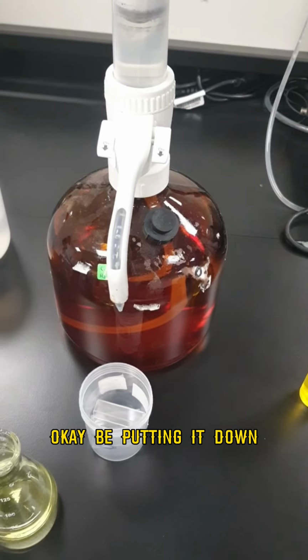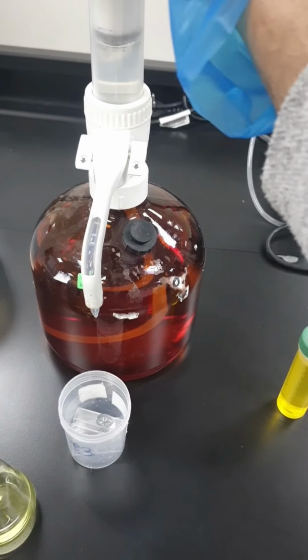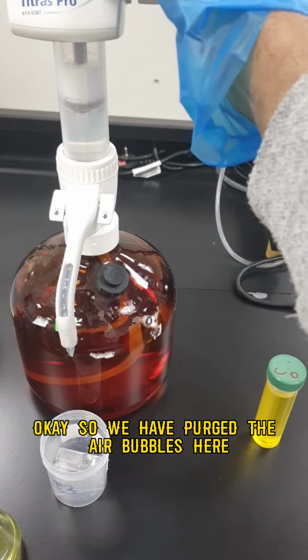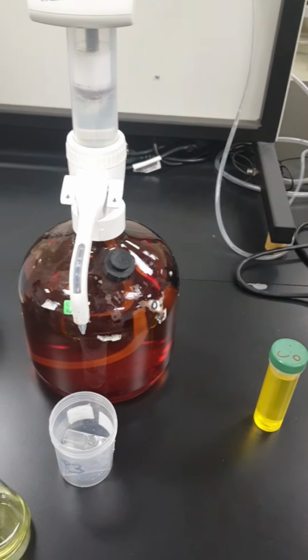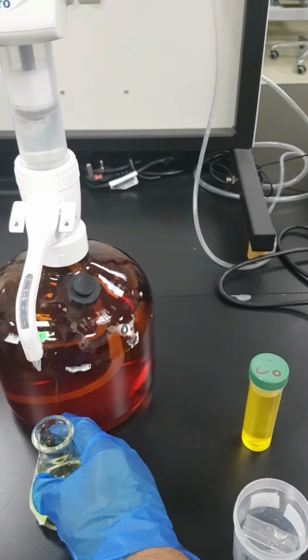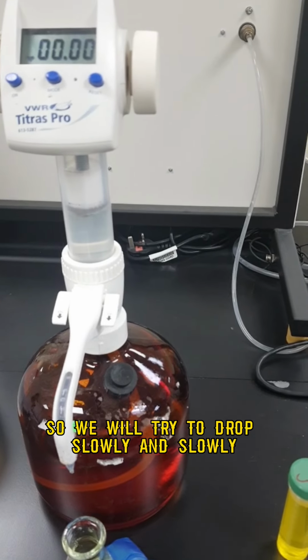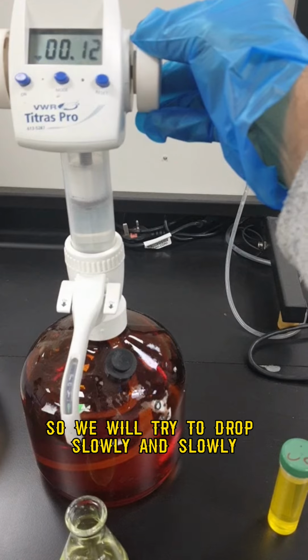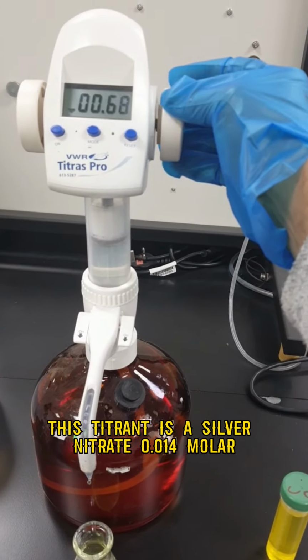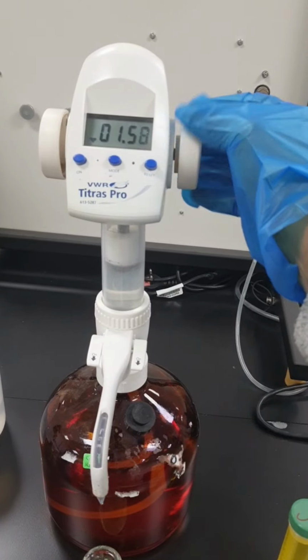Okay, we have purged the air bubbles here. Also this is set at 0, so we will drop our titrant slowly and slowly. This titrant is silver nitrate, 0.014 molar, and it is already standardized.